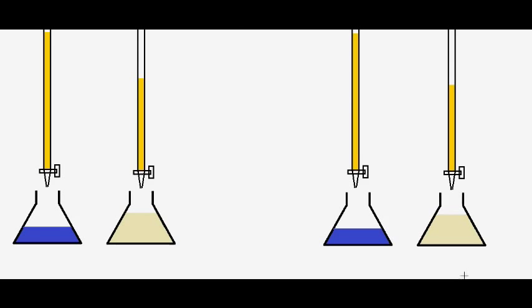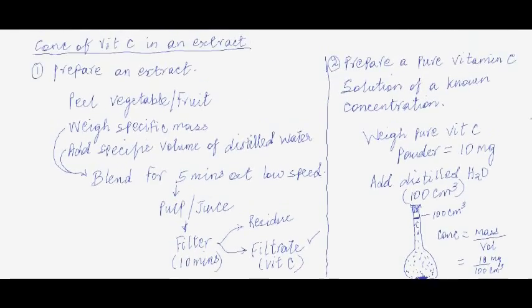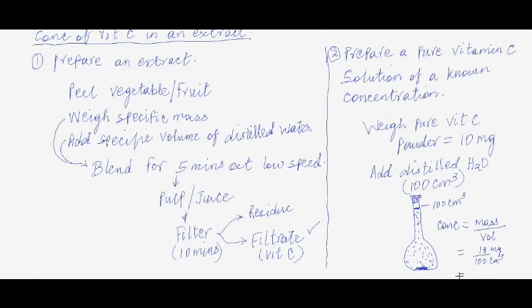a solution which would now have, if you divide both of these, 10 divided by 100, that would give you a concentration of just something around 0.1 milligrams per centimeter cube, or centimeter cube inverse.